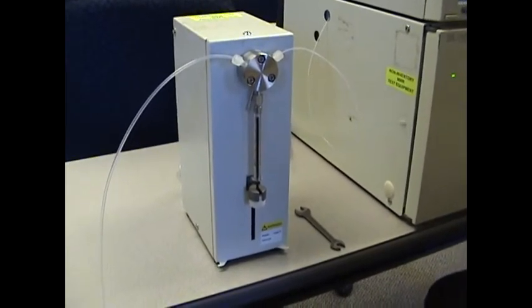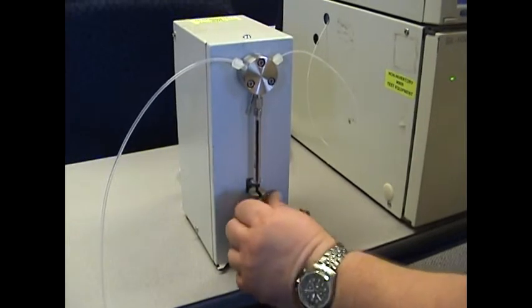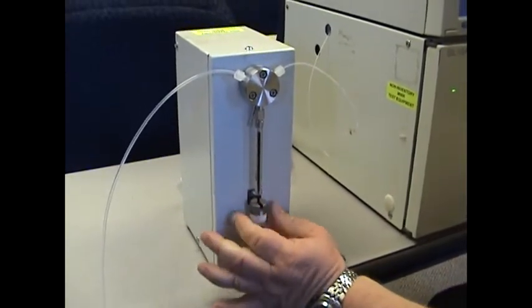You want to first loosen the white Teflon nut at the bottom. This will free up the plunger for the syringe.